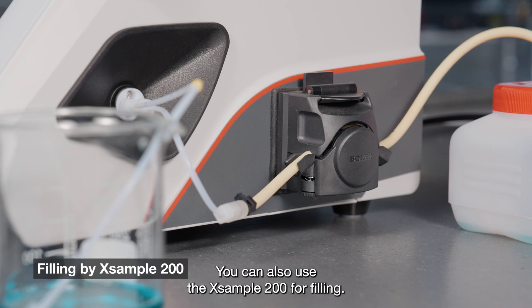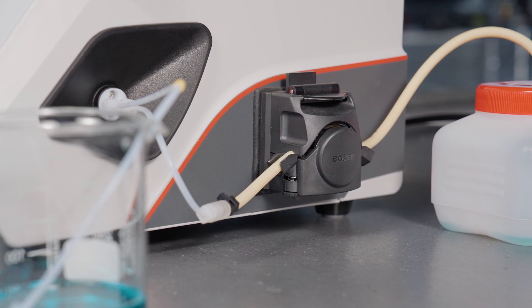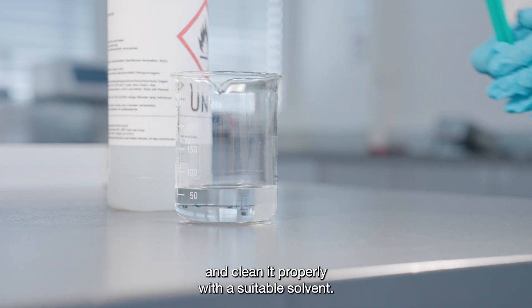You can also use the XSample 200 for filling. After a successful measurement, empty the measuring cell and clean it properly with a suitable solvent.